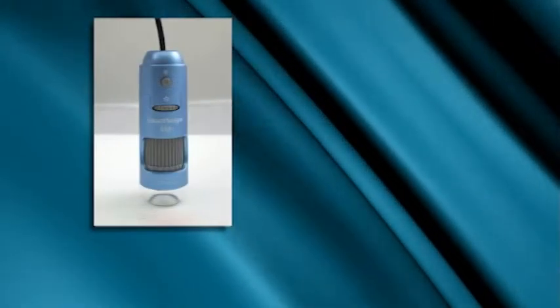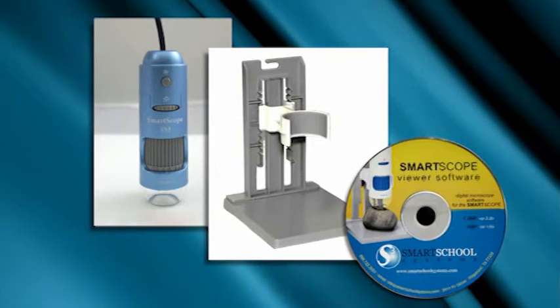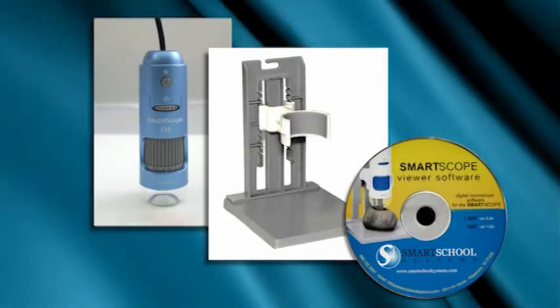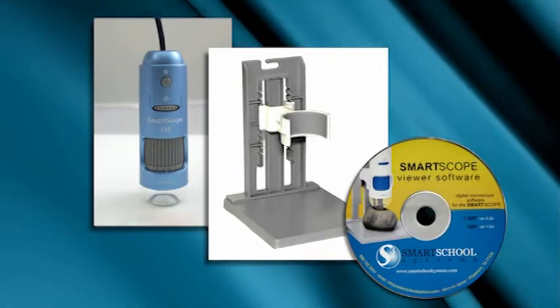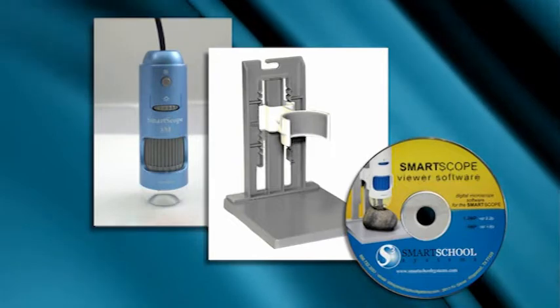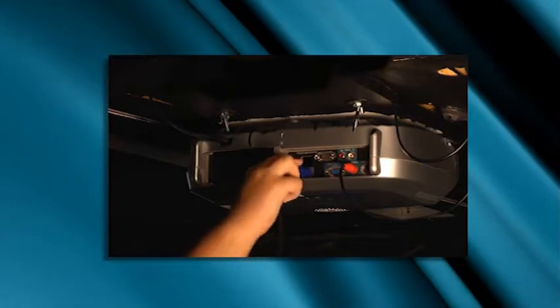Included in the package is the SmartScope 5M, the stand, and the software site license. So you can install the software on all of the computers on your campus. The software is compatible with both PCs and Macs, and the SmartScope 5M works great with interactive whiteboards.